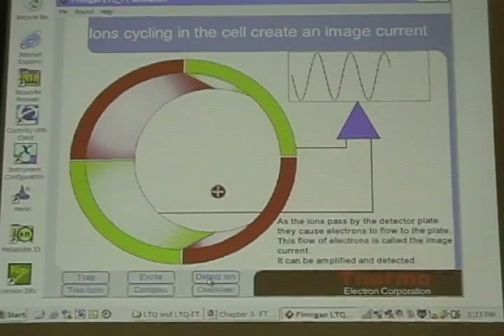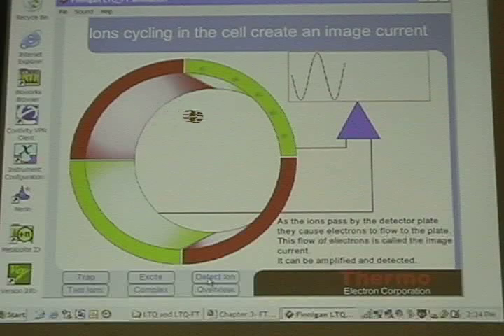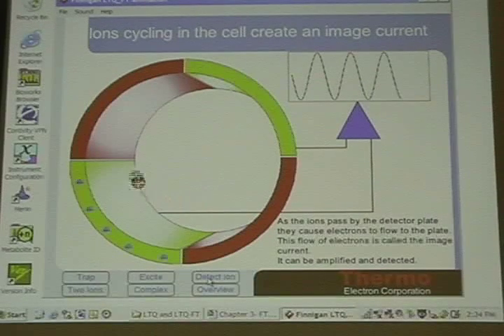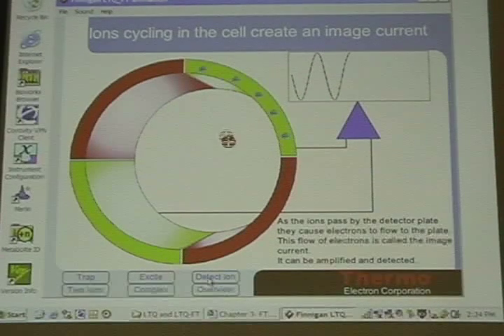So say I set it at 1,000,000 and I set it at 1 second. Would all those ions be accumulated first in the ion trap and then all be passed out? Correct. Okay. So changing the AGC on the FT changes what? The amount of time that the linear trap opens to fill up prior to dropping into the FT.